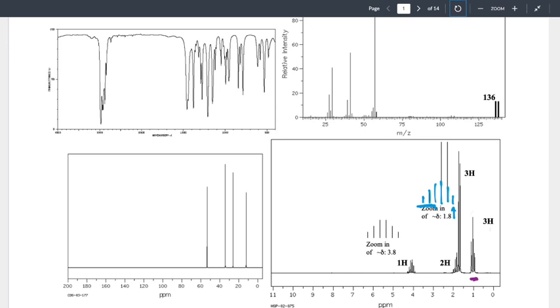Right? So I'll start at the bottom here and say, as a summary of a piece, I have a CH3 bonded to a CH2, right? Was that one? Yeah. Okay, so all I'm doing is summarizing that piece down there. Could that CH3 be the same as the CH3 identified in the previous step?